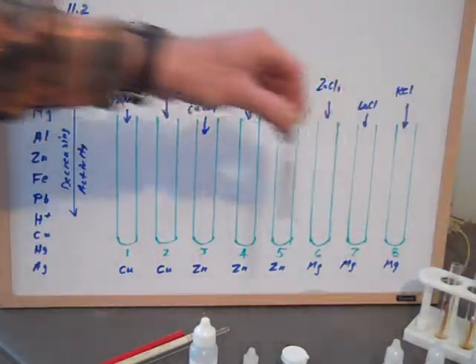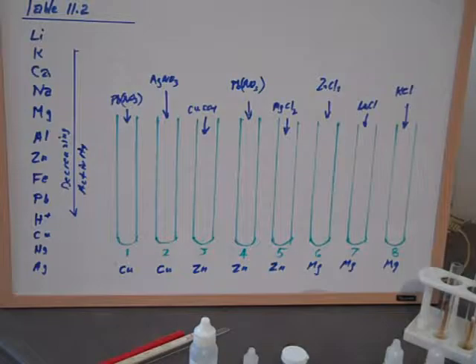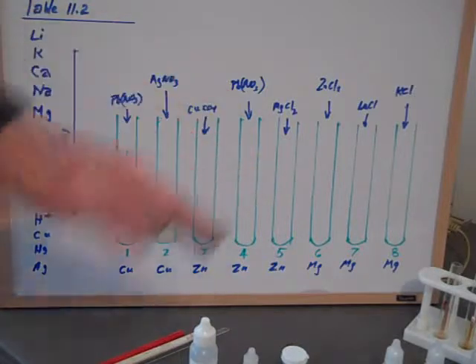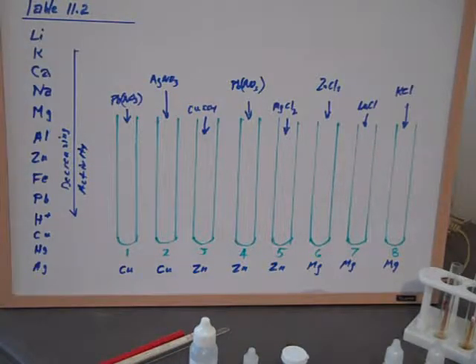The next three have zinc strips in them, and the last three have magnesium strips in them. You can see that. Two are in a beaker standing by. In just a second, we'll move the camera. Let's review what happens here, what's supposed to happen, and see how we're going to do it.